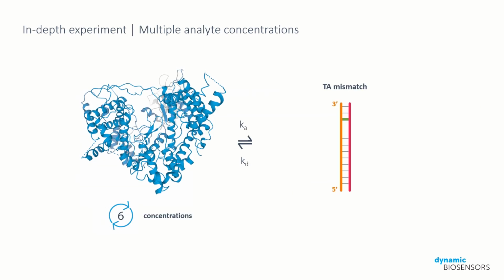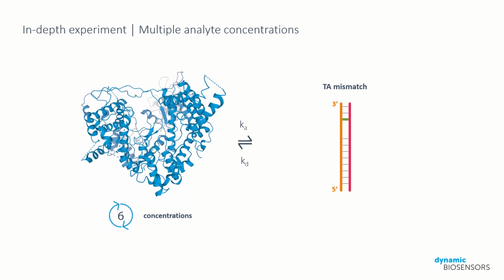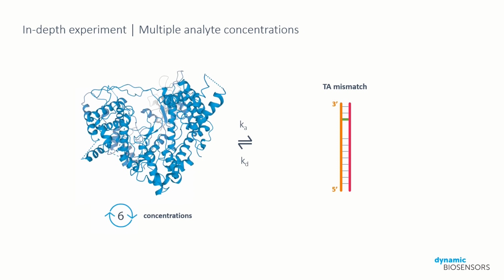We will now show an example experiment for the more in-depth kinetics analysis. The TA mismatch promoter showed good interaction in the multiplex screen, so we will use it as the ligand and a series of T7 concentrations as analytes in order to demonstrate how to more accurately measure binding kinetics and affinities.